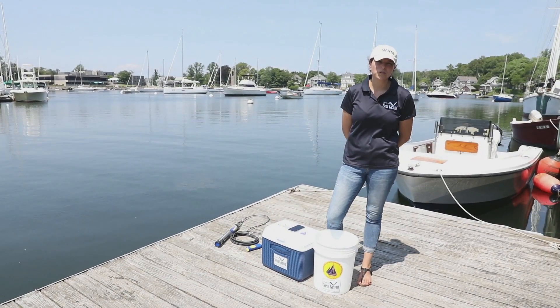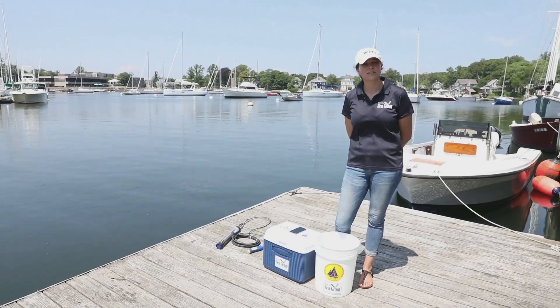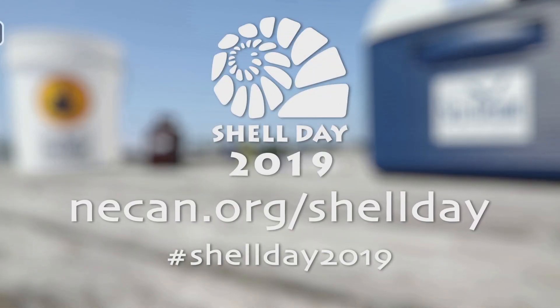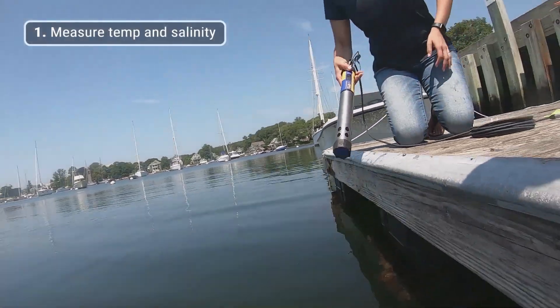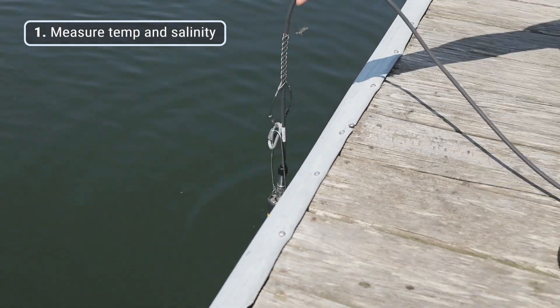Today we're here in Woods Hole and I'm going to be showing you how to collect a water sample for total alkalinity for Shell Day 2019. The first thing I'm going to do when we get to our field site is measure the temperature and salinity of our water body. I'm using a multi-parameter data sonde to collect temperature and salinity out of the water body itself.